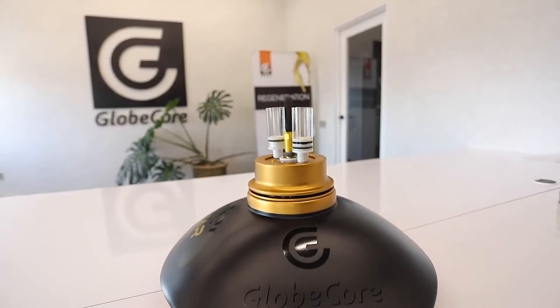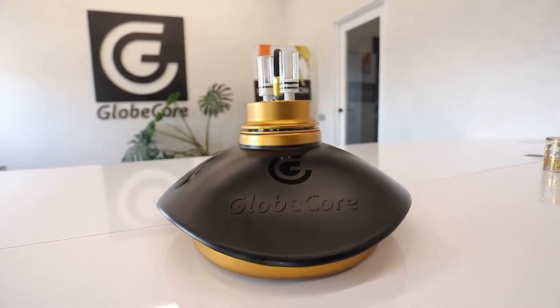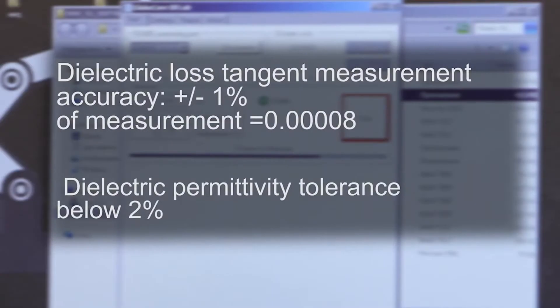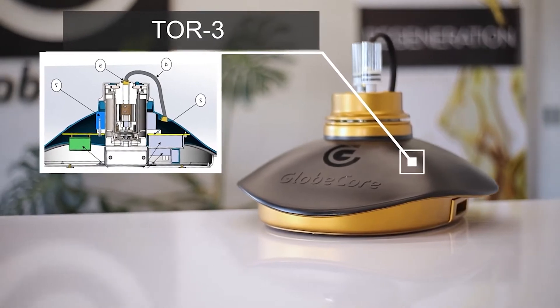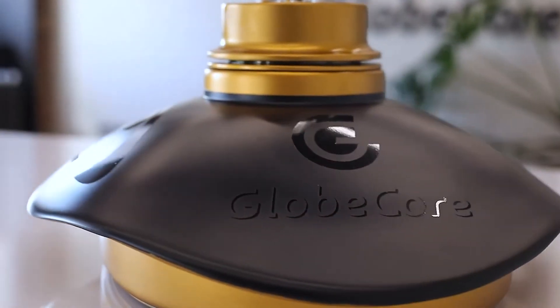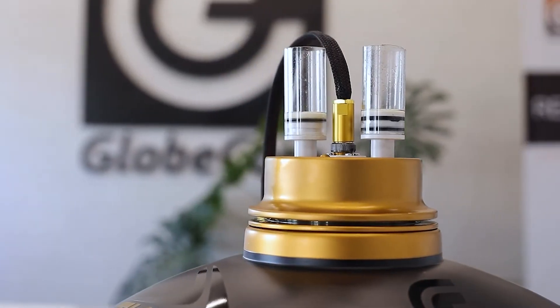The measurement error of the dielectric loss tangent does not exceed 1% plus 0.00008, and the measurement error of the dielectric constant does not exceed 2%. High accuracy and stability of measurements is achieved with the new technologies GlobeCore implemented in the development of the reference capacitor.